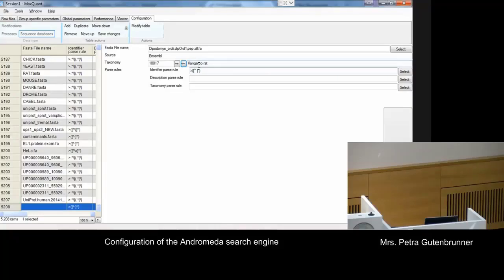But I can. Yes, it's fine. So Okay, it depends which one. Should I pick the mouse one? I like Arabidopsis. Okay. Whatever, it's kind of just bootcamp, you know, just to show people. maybe you can later try this out with the FASTA file, and I would say we keep going here. Otherwise, we run maybe in time problems, if that is okay by you. I'll show you example. So take zebrafish. And of course, yes.